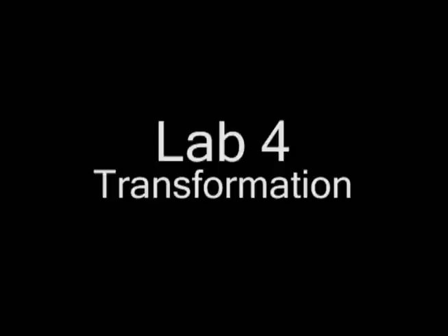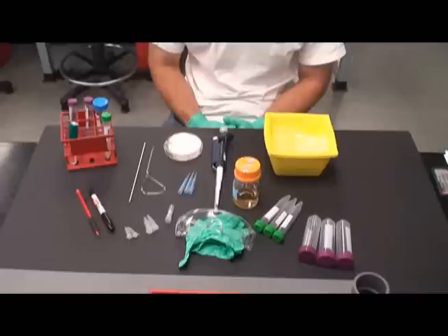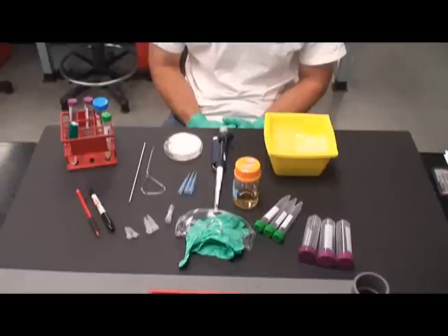Lab 4: Transformation. The materials you need for this lab are shown here.